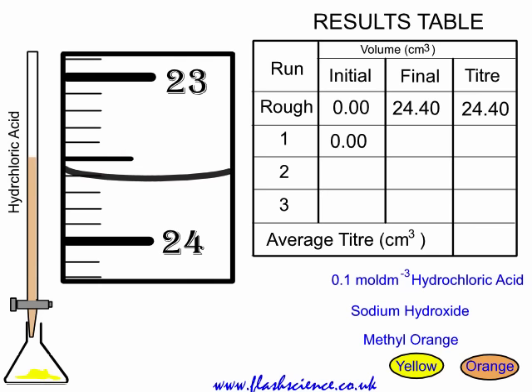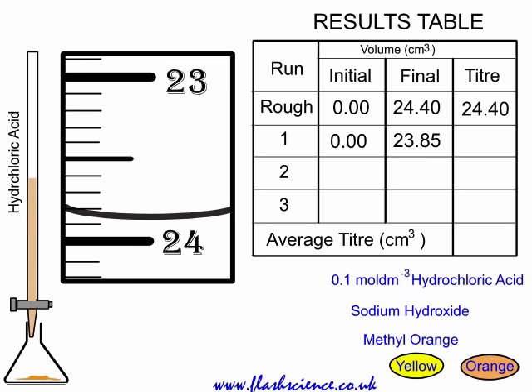It may turn from yellow to orange but go back to yellow again at this stage. Lots of shaking is required, and you want to add just enough to make it go orange and stay orange. Look at the titer — it's halfway between 23.8 and 23.9, so 23.85 is recorded as the final reading. The difference between the initial and final is the titer, so the first accurate titer is 23.85.